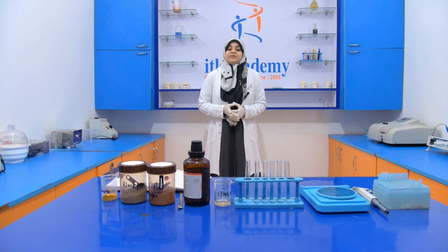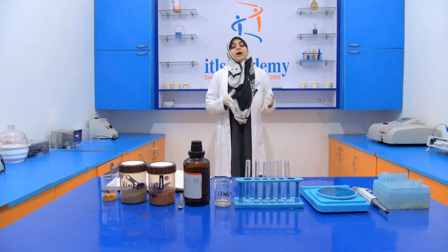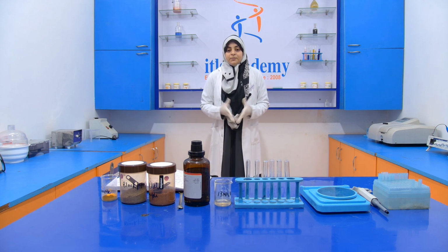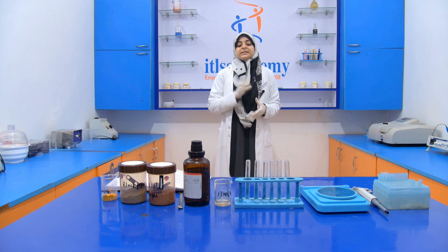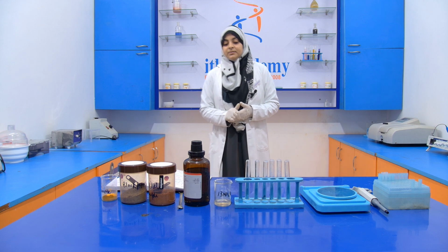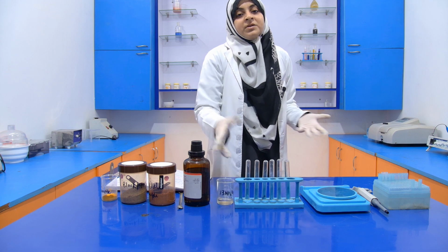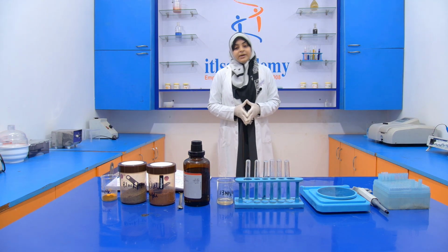For this, you can visit our YouTube channel in which the solution preparation videos are already uploaded. Each formula is discussed in that video. You can go and check the video and understand how we prepare this 13 normal sulfuric acid. Okay, this is our 13 normal sulfuric acid. Now obviously this sulfuric acid is prepared from concentrated sulfuric acid.